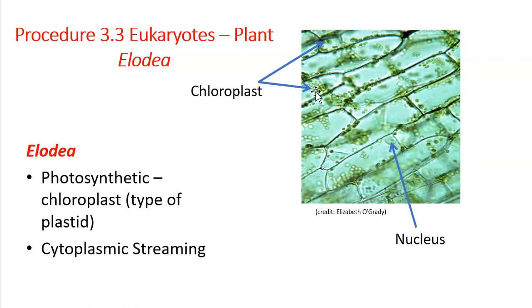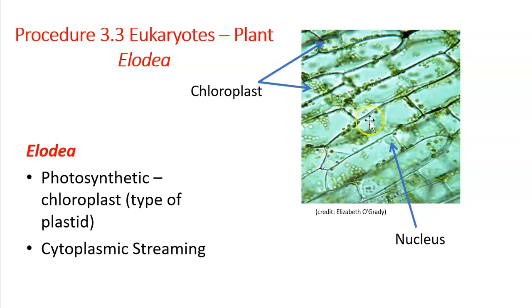Oscillatoria was photosynthetic but did not have these membrane-bound organelles called chloroplasts. Here, we're looking at a photosynthetic plant cell, and we can clearly see those little chloroplasts. In addition, the cells have a sort of uniform, almost rectangular shape. That rectangular shape is because of the plant cell's rigid cell wall. Within the cell wall, the plant would have a plasma membrane, but what gives it that uniform shape is the cell wall.